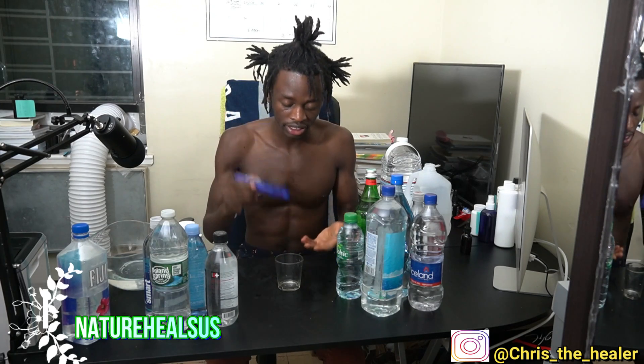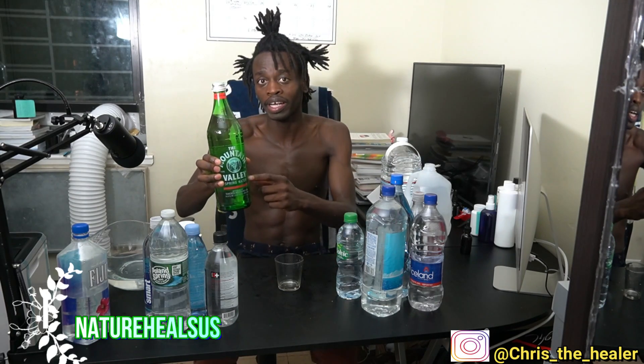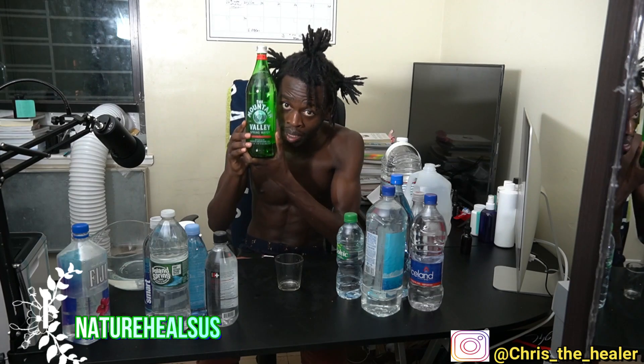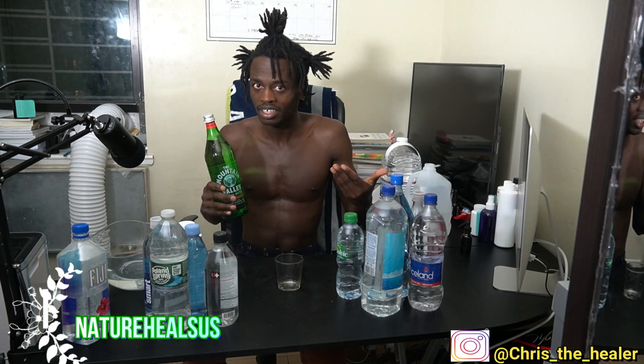The next water is Mountain Valley Spring. A lot of people buy this water at Whole Foods — it has this water all the time. People say it's the best because it's in a glass bottle, so therefore it doesn't leach anything as opposed to plastic. We're about to see how much is in this water because it is spring water — spring water inside a glass bottle — even though it costs around $20 for a glass bottle. Let's find out.